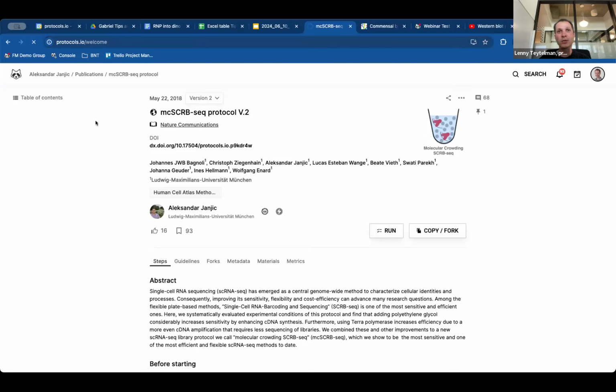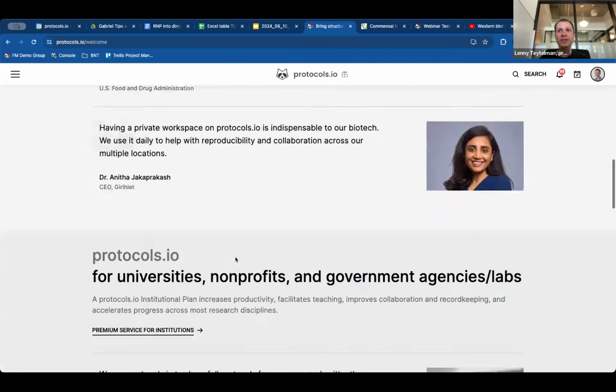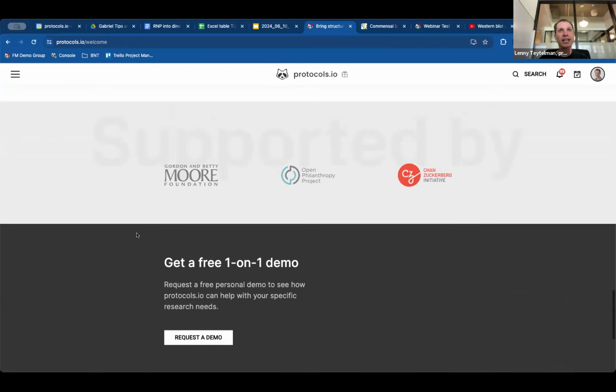And I think it was one or more people who were using Protocols.io and needed to submit to journals that do double-blind peer review. So I'll give credit to my colleague, the director of engineering, who has been co-founder from day one when we started this effort, Alexei, for implementing it, but the credit for the feature is from users like yourselves. And we really welcome feedback and input.